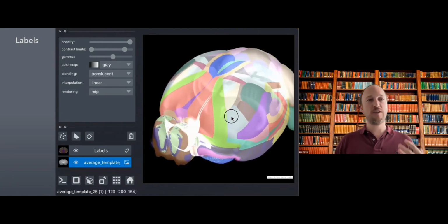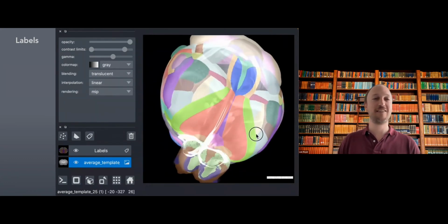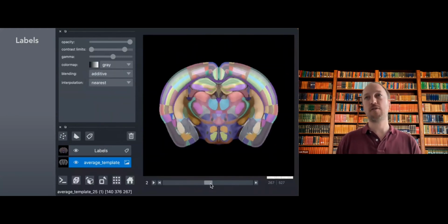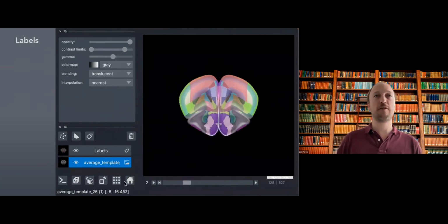For sure, 3D is the first thing that needs to work after 2D, and ideally it works for ND anyway. But here are examples of how you can do labeling in 3 dimensions on some brain data from the Allen Institute.